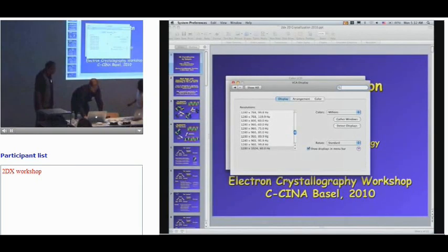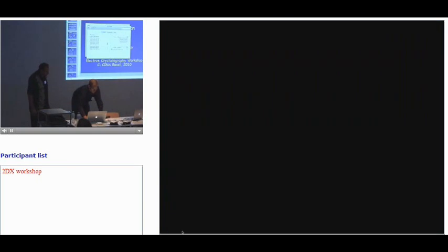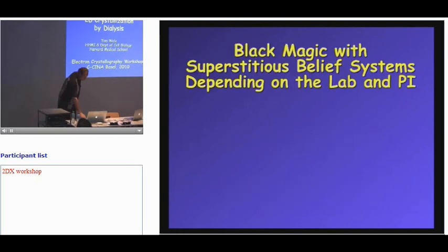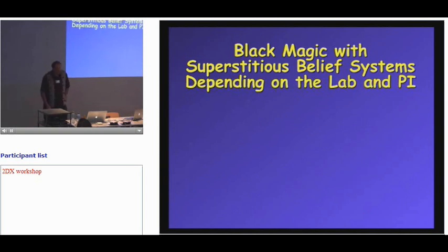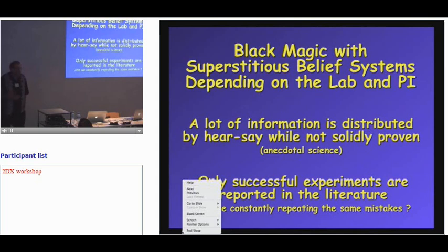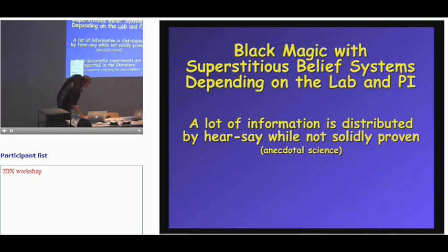Because my first slide is great. So with my first slide, I'm trying to get you into discussion, and one way to do this is to really provoke people. My view of 2D crystallization is that it's kind of voodoo. You can never predict what is going to work and what is not going to work.